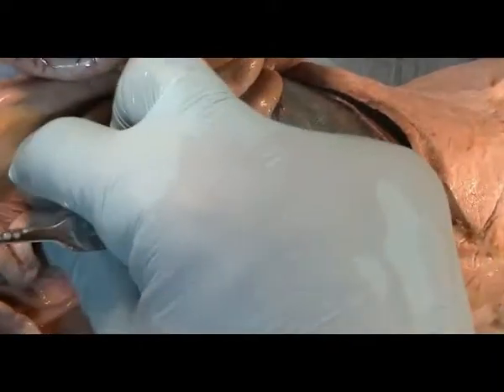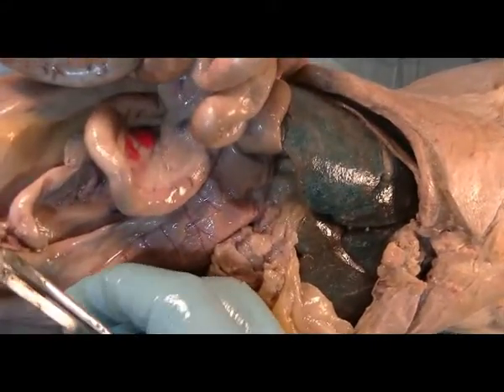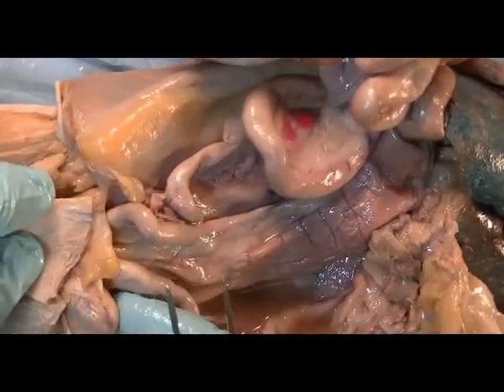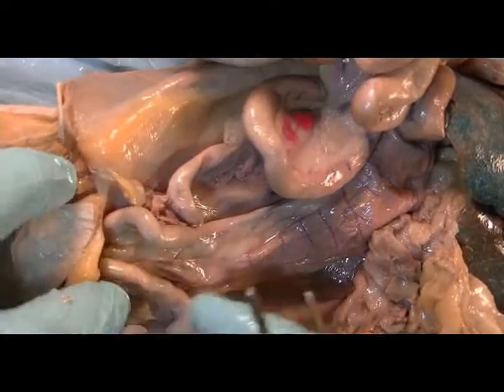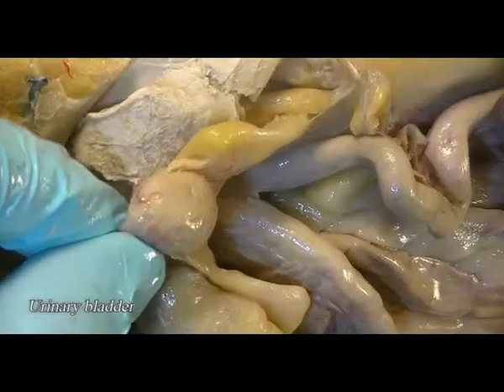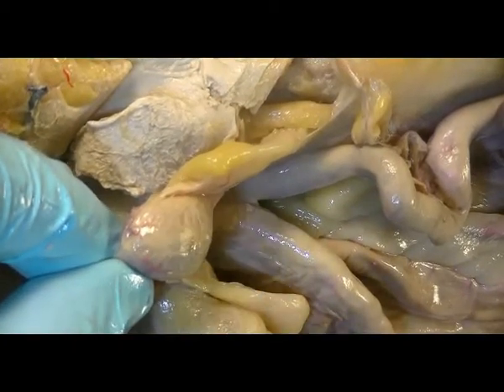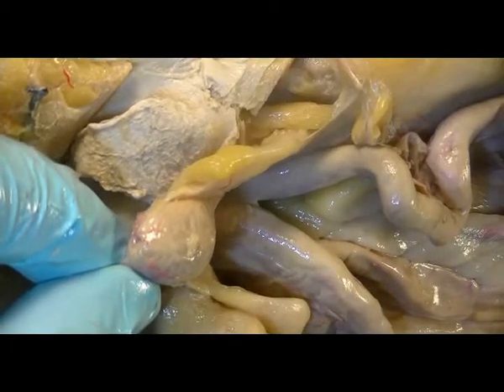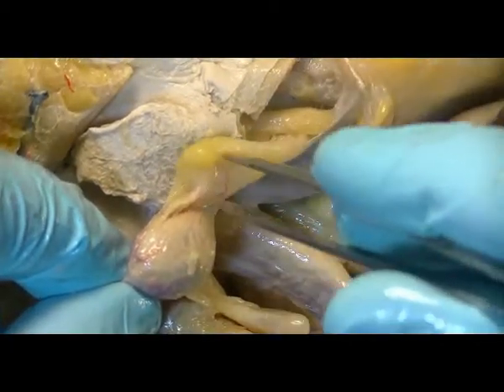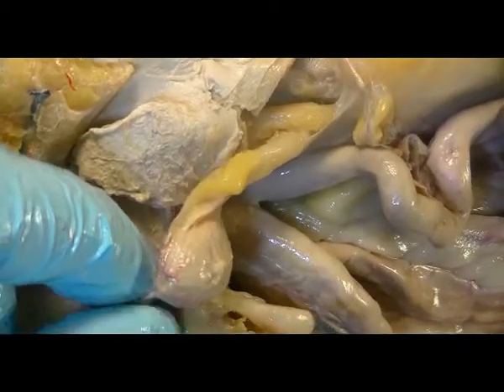This cat is a female because you can see the uterine horn, which is this structure here. Let me just move the camera a little bit. There. And here's the urinary bladder down here. My finger's on it. Okay, here is the urinary bladder, and it's anchored by these two lateral structures called the lateral ligament of the urinary bladder.